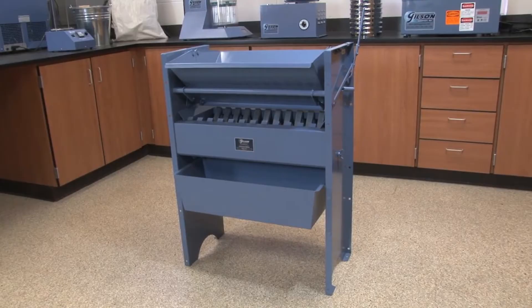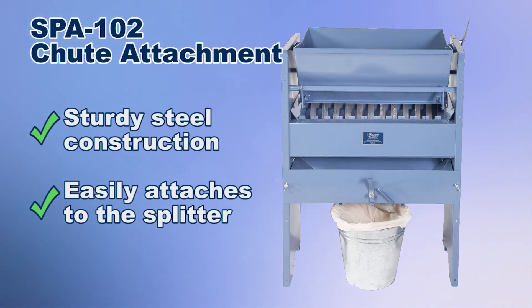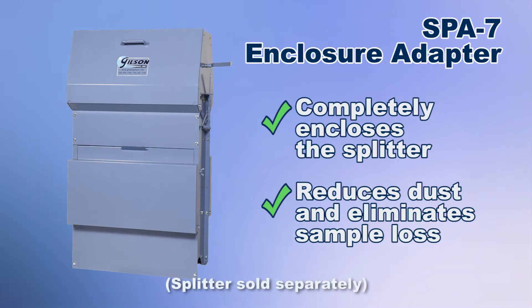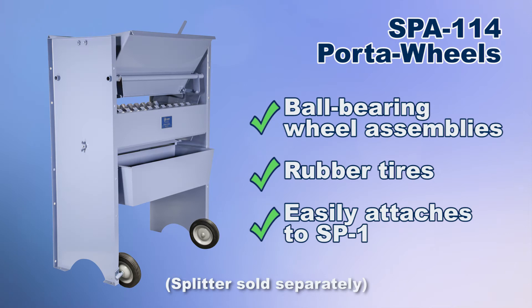The SP-1 accessories include the SPA-102 chute attachment for direct loading of sample splits into a bag or container, and the SPA-7 enclosure adapter for maximum dust control. The Gilson SPA-114 Porta-Wheels adds mobility to your SP-1 Universal Sample Splitter.